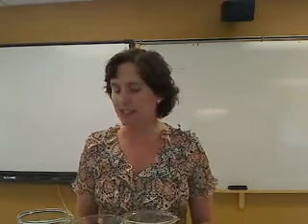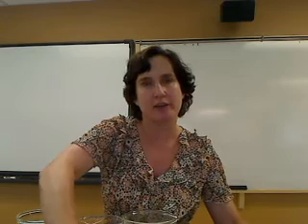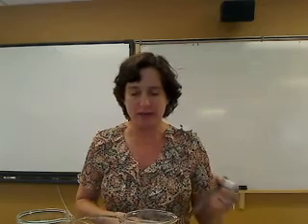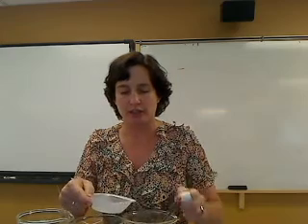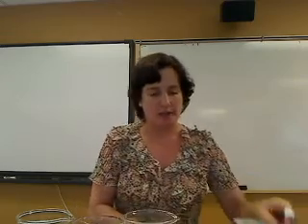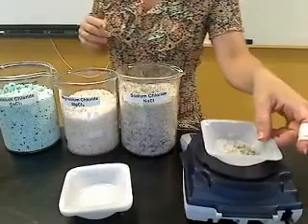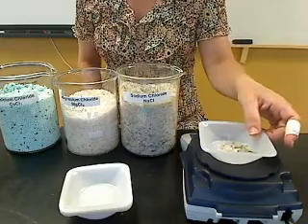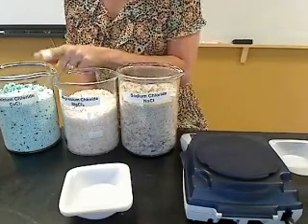So, how do you design an experiment? Well, you're going to need amounts of each of these, and one of the criteria that we're going to state for this lab is that you want to use up to 20 grams of each substance, but no more than 20 grams. So we want to work with small amounts here so that we make efficient use of our resources. You're probably going to need a scale, and let's go ahead and put this down here. Now it doesn't have to be 20 grams. It could be 10 grams, it could be 5 grams, but you probably want to be consistent in using the same amount of each ice melt.